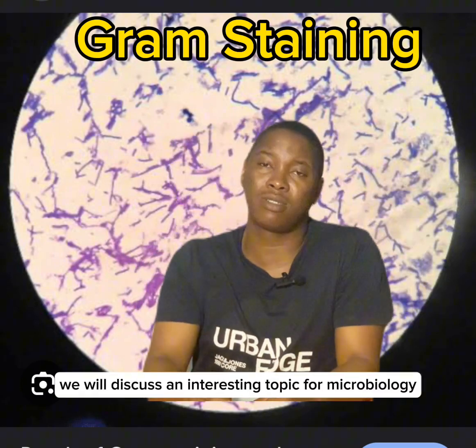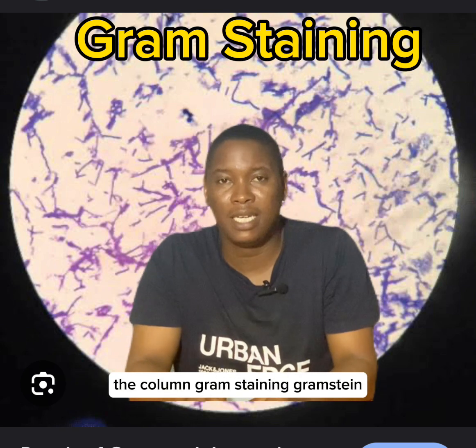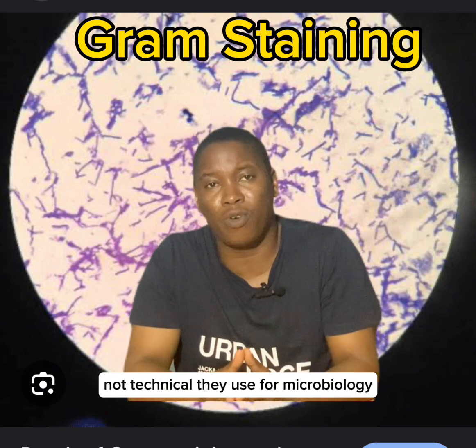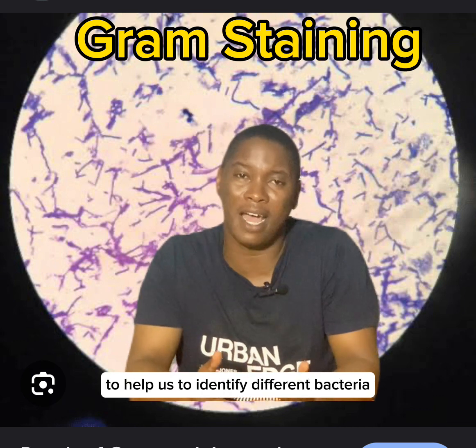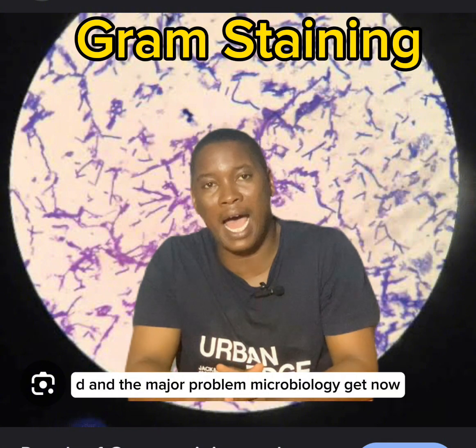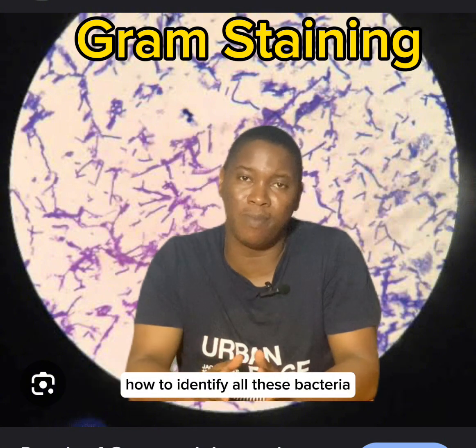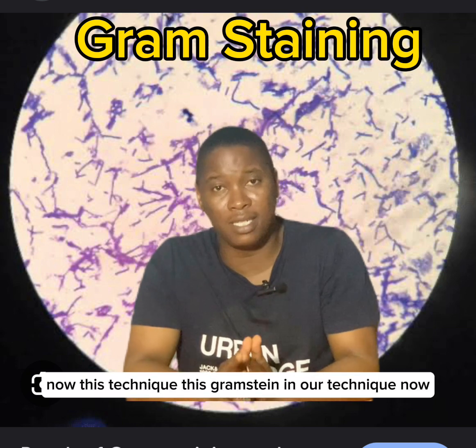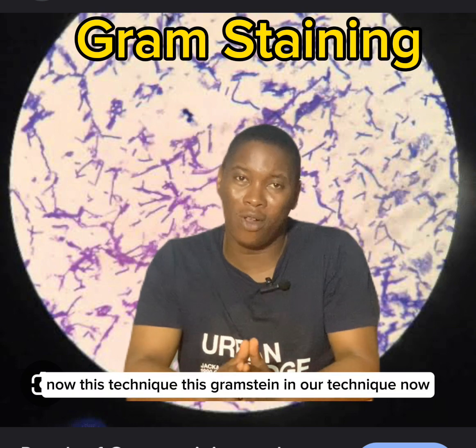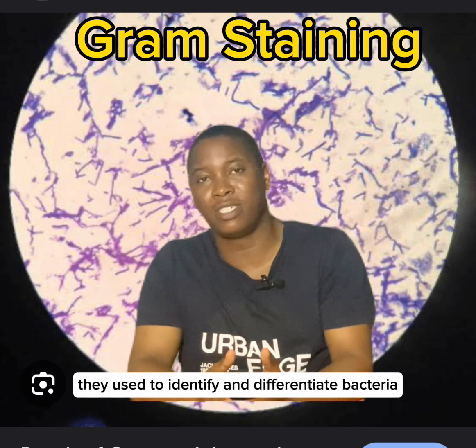Today we will discuss an interesting topic for microbiology. We dey call am gram staining. Now, gram staining na technique wey we dey use for microbiology to help us to identify different bacteria wey dey. You know say millions of bacteria dey, and the major problem wey microbiology dey get na how to identify all these bacteria. Now, this gram staining na one of the foundation techniques wey we dey use to identify and differentiate bacteria.